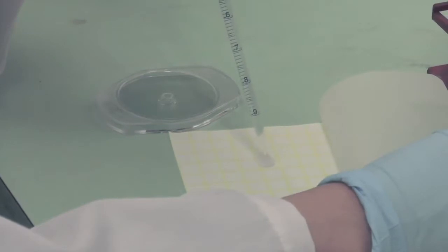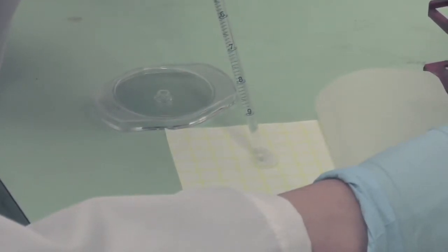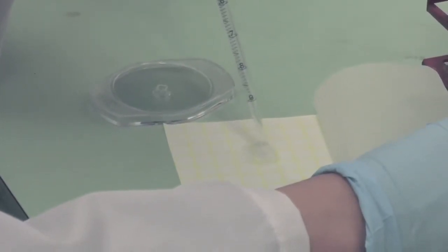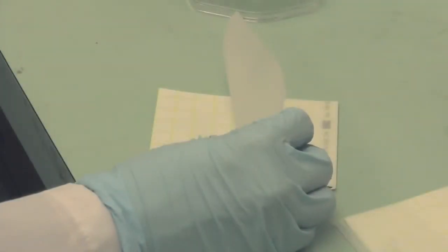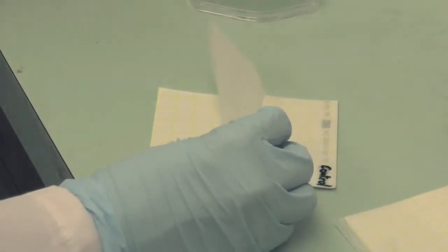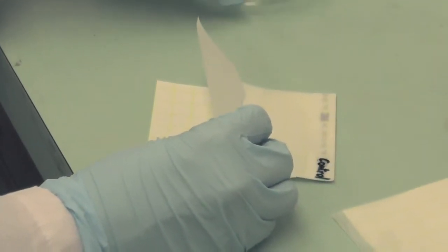Lift the top film of the petri film count plate. Dispense the inoculum onto the center of the bottom film. Release the top film onto the inoculum, taking care to avoid trapping air bubbles between the two films.